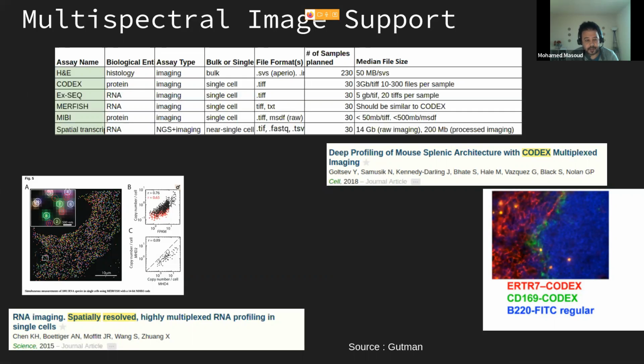So our role here can come in to analyze this image and try to find biomarkers that can identify a certain function or a certain disease.